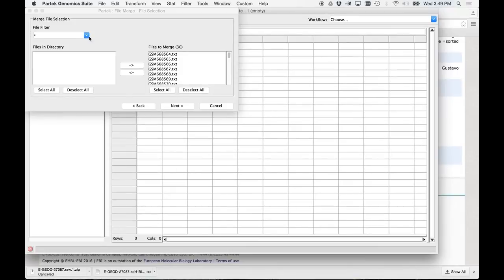File filter. No. We don't want to filter anything. All the files are in the directory. Files to merge. Everybody says 30, right? Okay. Hit next.